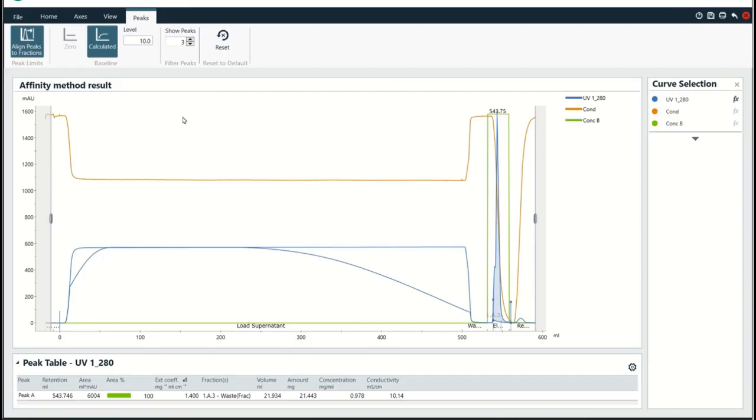Hi everyone. I did want to show you guys a result file from the method that we wrote together. This is an affinity method where we loaded a cell harvest sample. You can see we loaded about 500 mils on here exactly, which looked really good. This is where loading ended. And then after that, the UV went down a bit and then this is the fraction that we collected, right? So we'll just zoom in on that real fast.